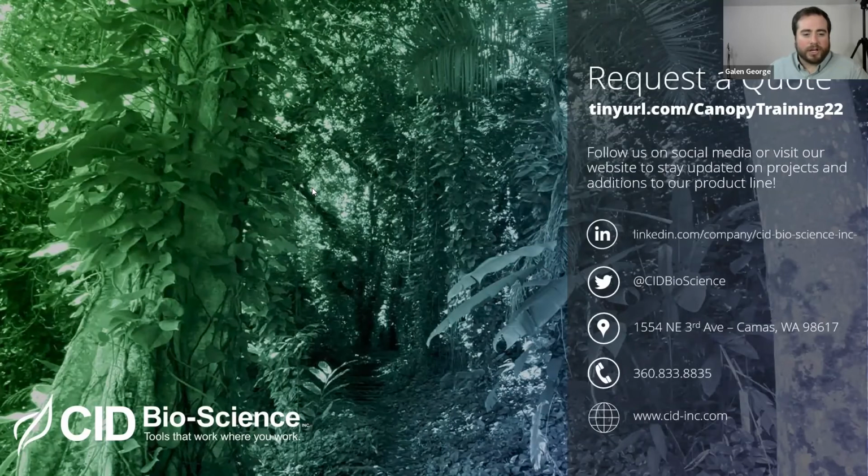Next question is, how does the 110 compare to the other non-image based LAI devices which calculate light interception from above and below canopy at different zenith angles, in terms of accuracy, post-measurement data processing, and ease of use? This is a great question. There are a couple of different technologies out there used for canopy assessment, and the advantage of hemispherical photography is the amount of data that you're getting, and the fact that with the gap fraction LAI, you don't need to do the above and below canopy.